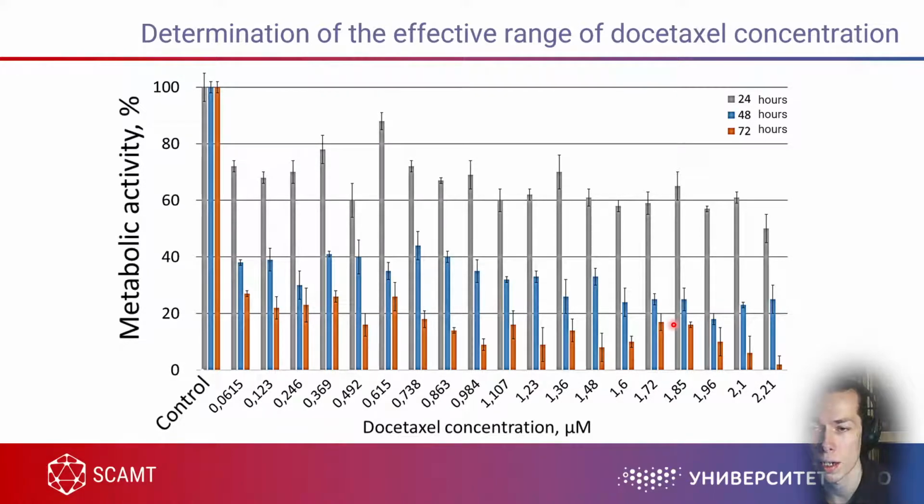At the time I performed this test I didn't use this, so it was just an anti-cancer drug. But now I know that Docetaxel can act only on dividing cells, because it interferes with tubulin and cells cannot divide.